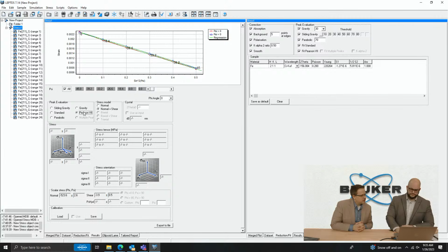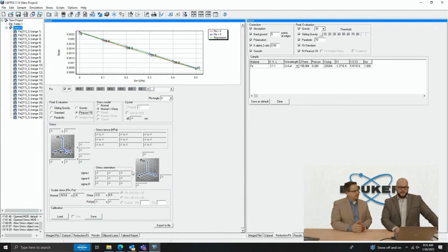And then in the bottom, I see there are these different matrices that correspond to that sigma 1,1. That's right. These are only going to be useful if you have a biaxial or full biaxial shear tensor, and that's going to give you the complete picture of the sample. I think in the 2D example, we'll be able to see that.